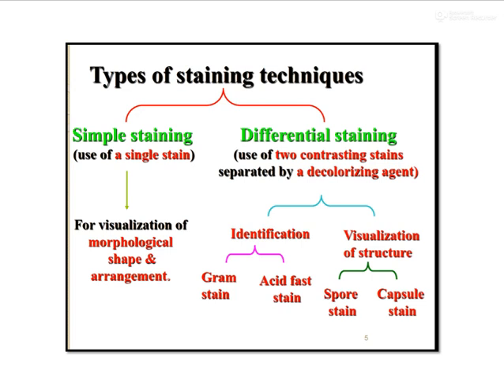Now, sometimes you can classify the organisms by using the Gram staining technique, or sometimes you can identify certain specialized microbes, the acid fast microbes. We'll be explaining what that is in the coming sessions. That is called the acid fast staining.